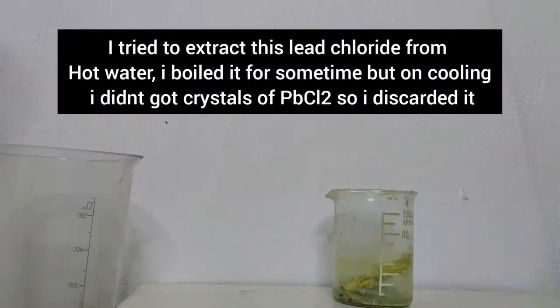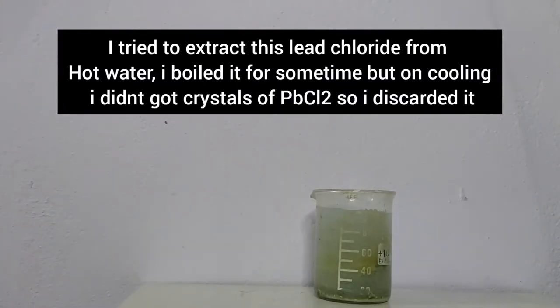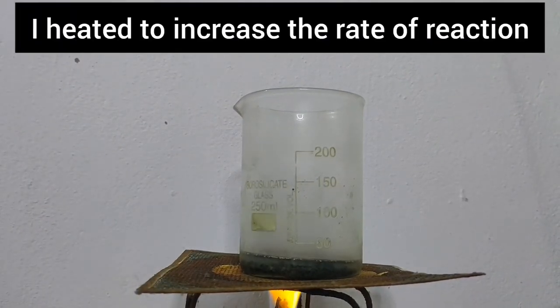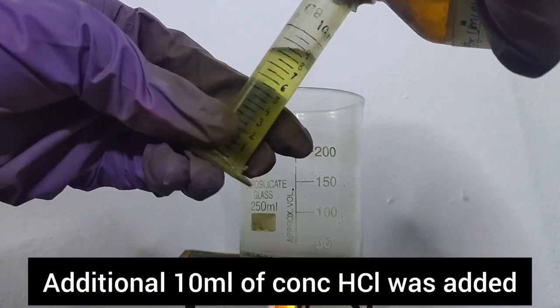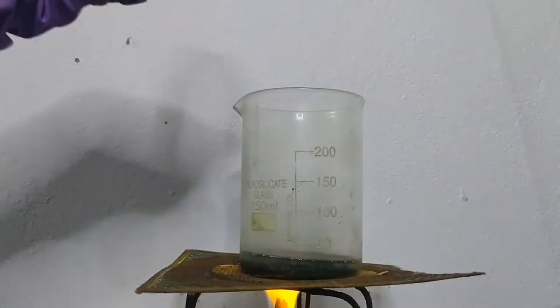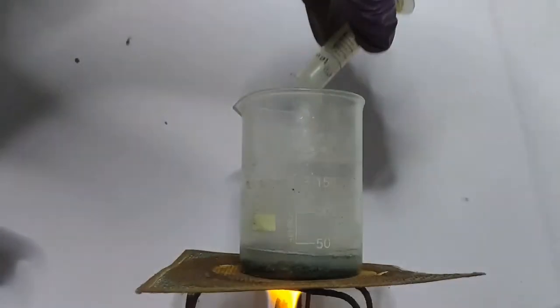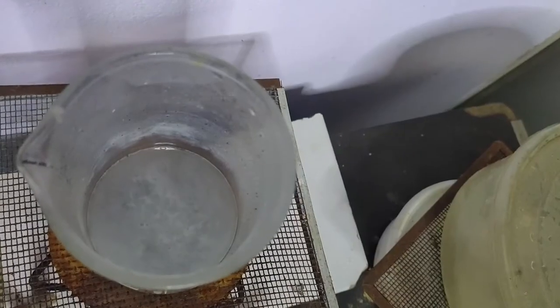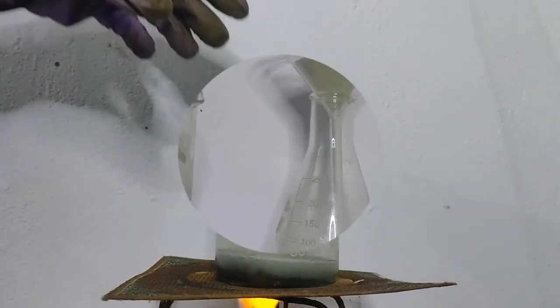This is the leftover anode and I tried to extract lead chloride, but I could not extract it, so I discarded it. Now, I heated up the solution so that HCl could react faster. I also added 10 ml of HCl. On heating, the reaction got faster. And you can see bubbles of hydrogen gas are being evolved.